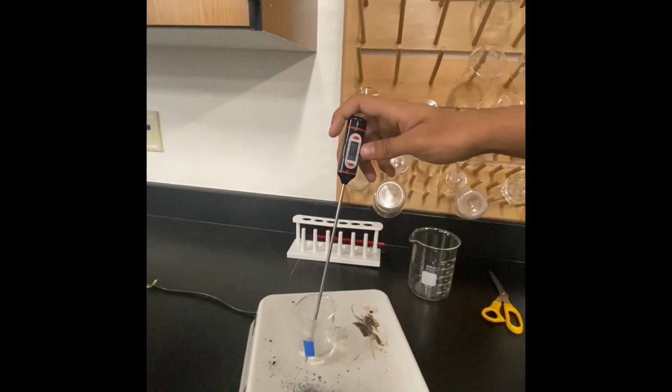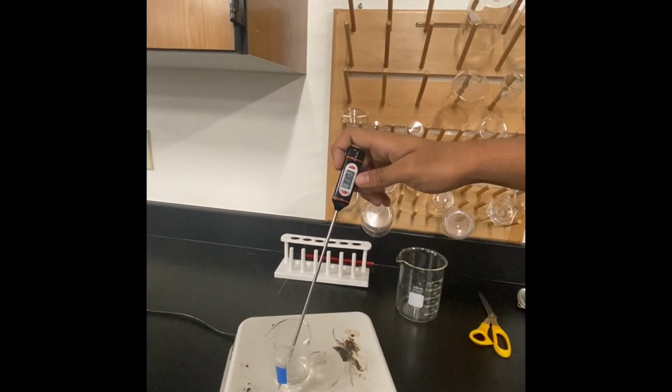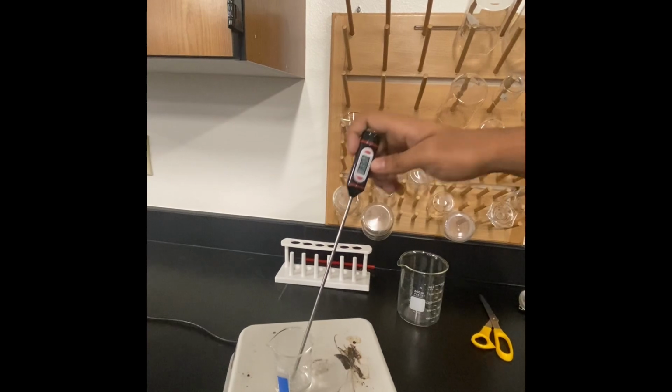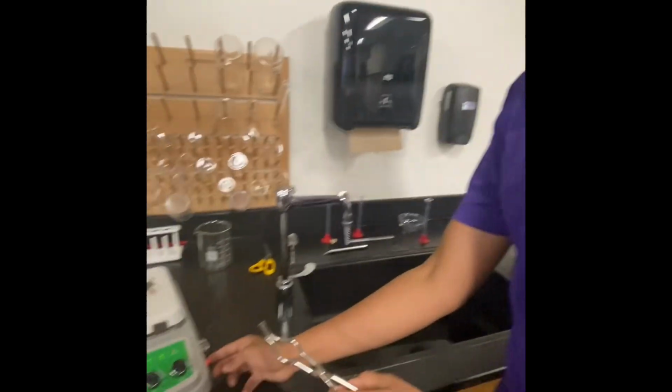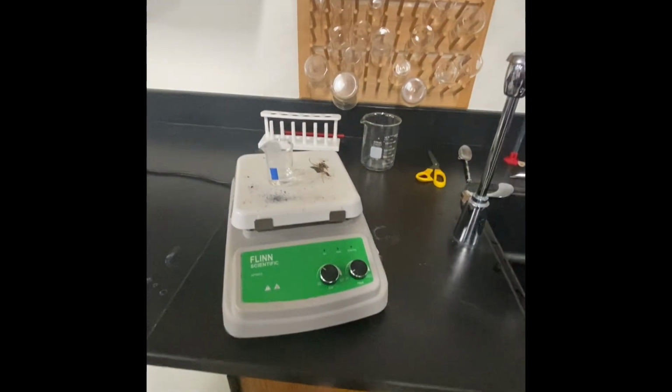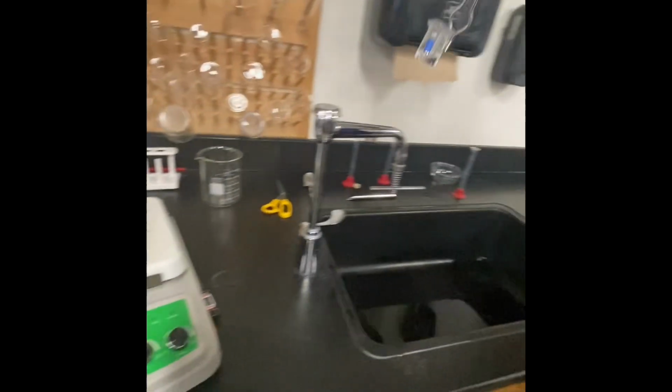Just a little bit. It doesn't exactly have to, it just needs to be above, I want to say 85, which is perfect. We're going to turn off this hot plate, and take out this beaker and put it in the sink to cool.